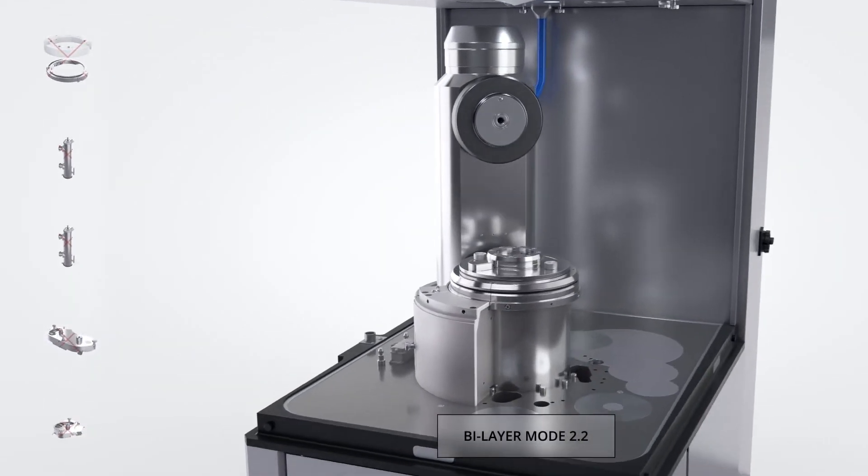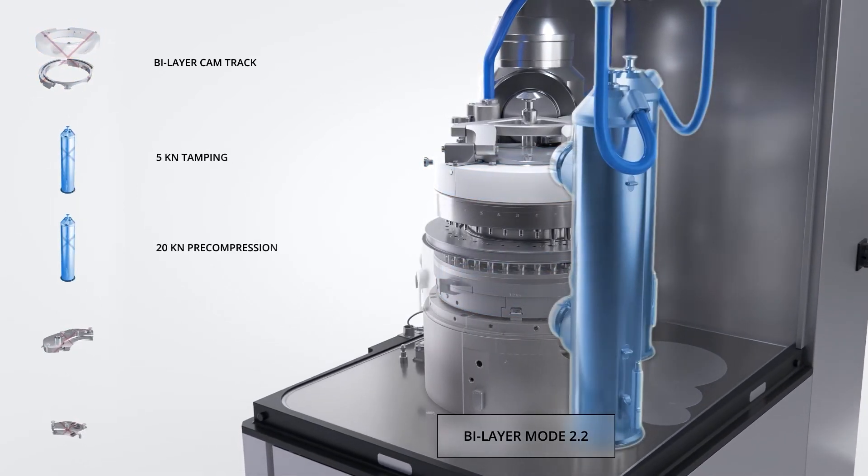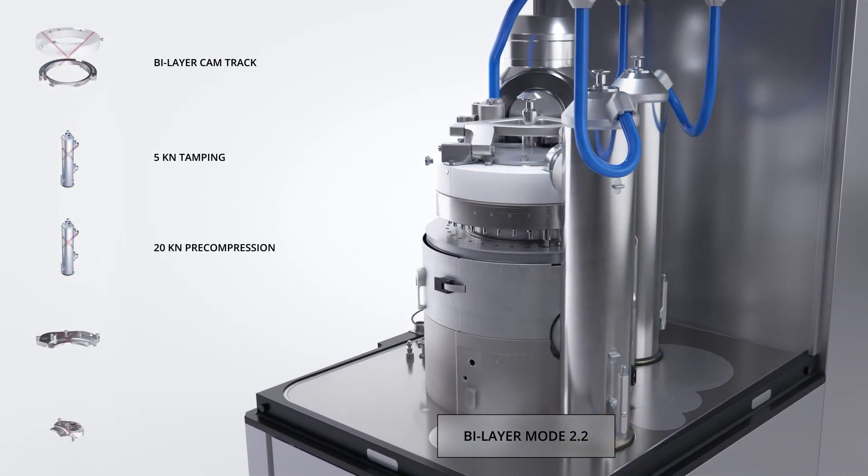Bilayer mode 2.2 is ideal for most bilayer products where the heavier layer is in layer 1 and where pre-compression on the final tablet is desirable.